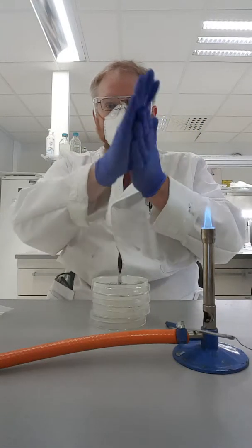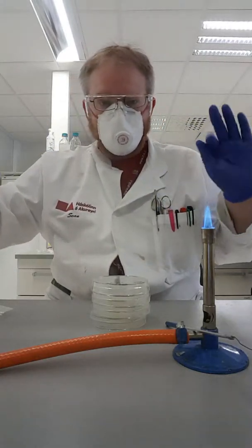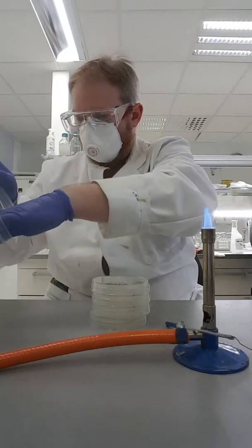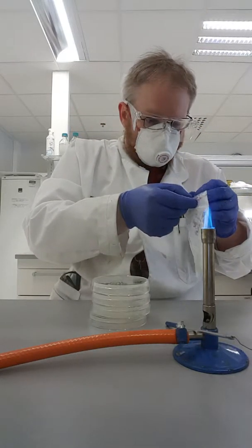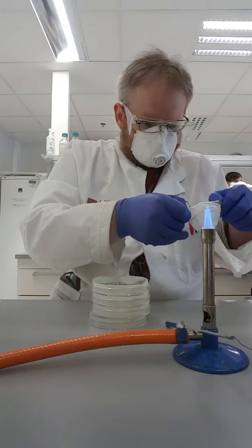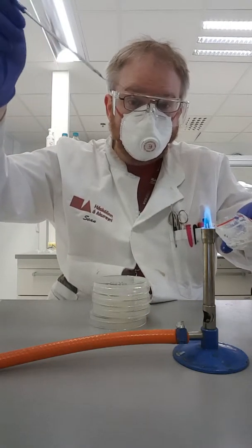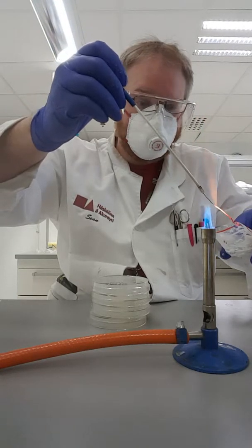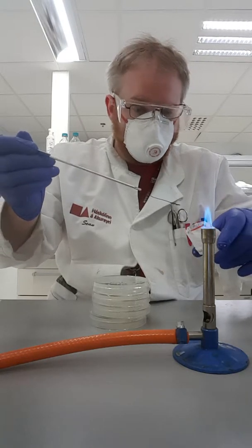Let's sterilize my hands again. Now what I'm going to do is I'm going to take the stuff out of the bag — it's quite ucky stuff. I'm going to try to open this. I'm going to work near the flame, which helps keep bacteria from the air away. I'm just going to heat up my loop again and let it cool so I don't kill the bacteria or the yeast that I want.